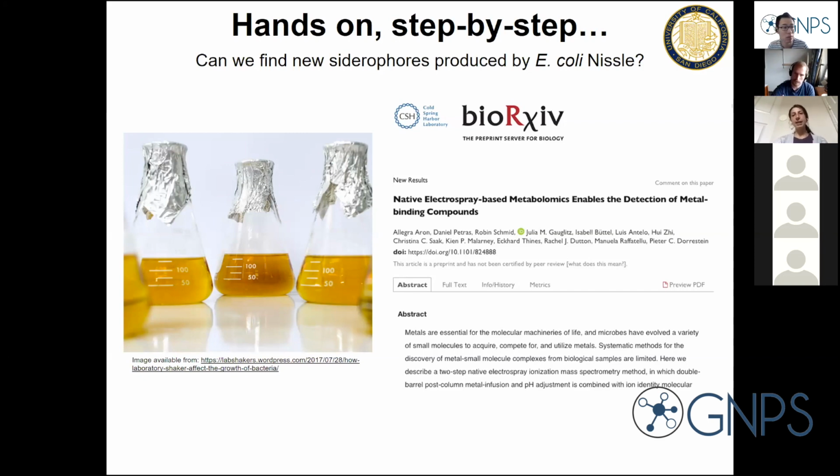If you're interested in understanding this data set, in addition to the technology in general, I'd encourage you to look at this preprint on bioRxiv, because it goes through what we're going to be discussing today. And the cool thing is that all of us together are essentially going to be doing what we did in this paper to discover some new siderophores.